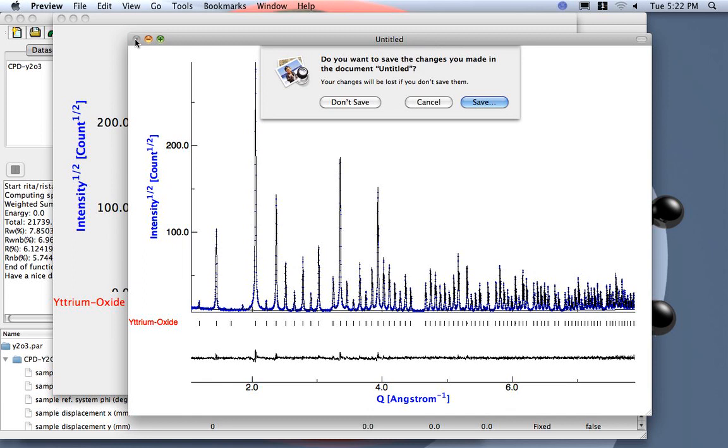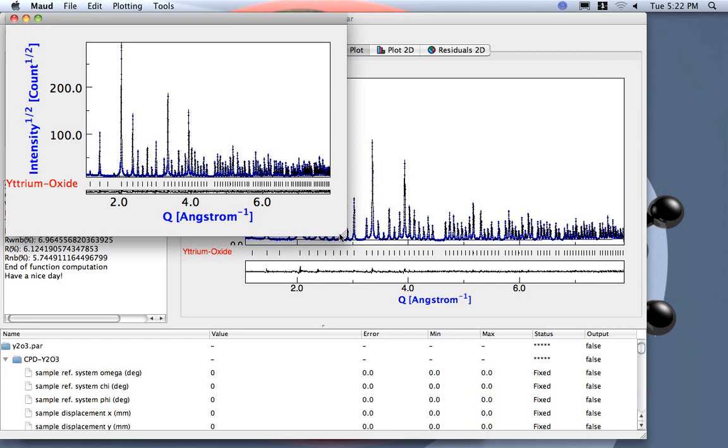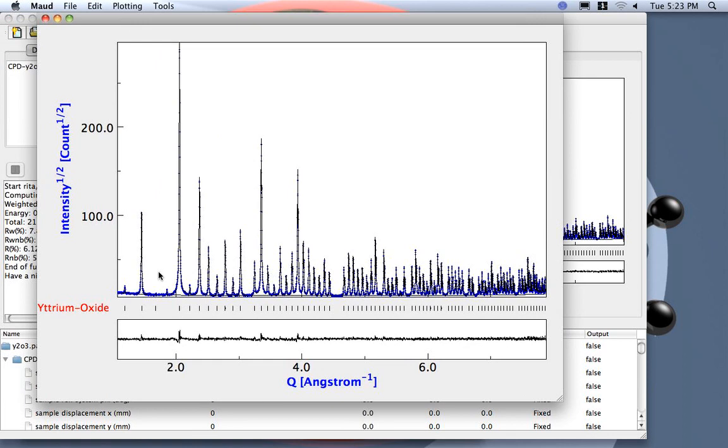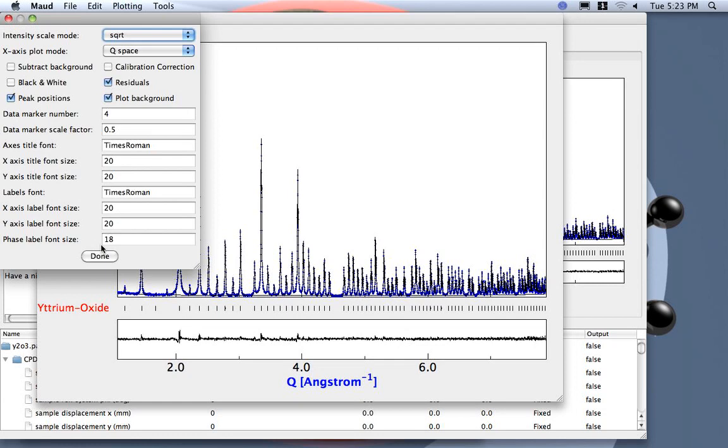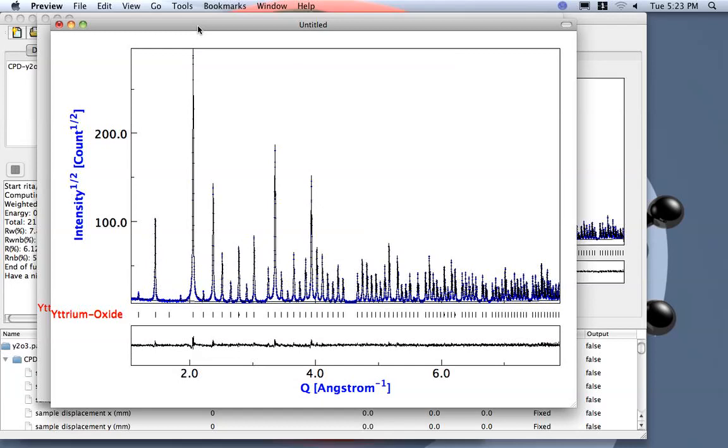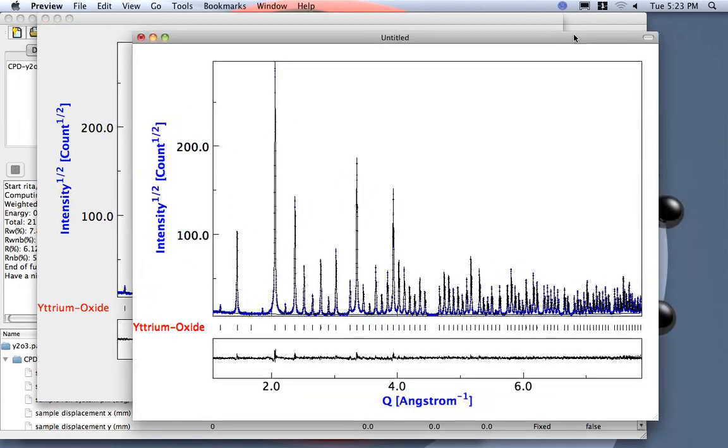So here to avoid this problem, when you have finished changing the options you just close and reopen the window. If you didn't close the program and reopen, it does not remember the size of this window but the font, everything is ok. So I close. Now if I copy and I go again to Preview and new from clipboard, now it is ok. Also notice that in the paste I don't paste also the grey part here, so this is maybe better for publishing purposes.